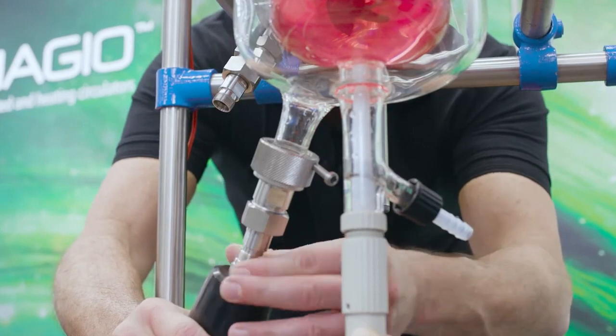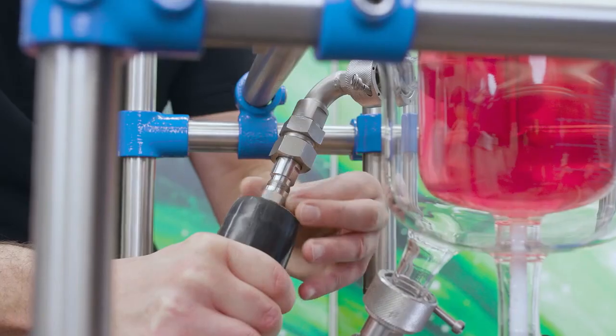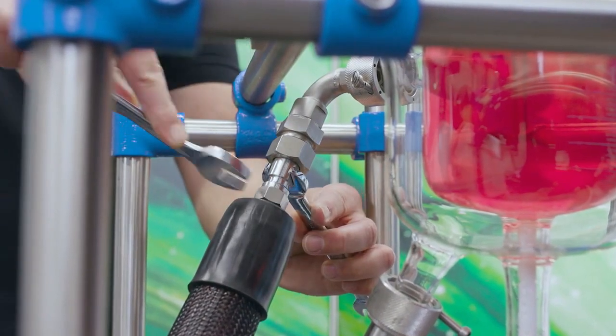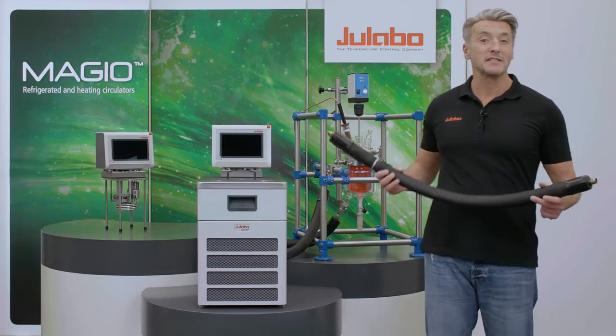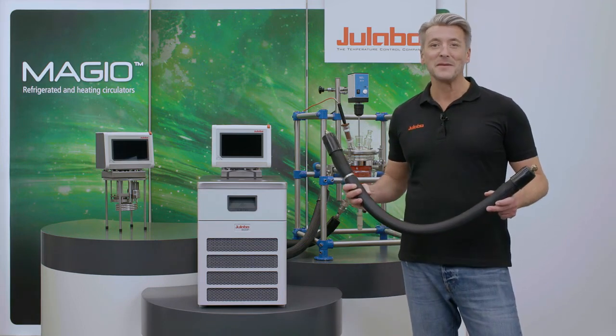The output is always connected to the lower connection at the reactor or external recipient and the input to the upper connection. In this way, possible air in the system will be able to escape correctly. To ensure you get the best performance, we offer special insulated tubing in various different lengths. Please make sure not to bend the tubing too much and always keep the specified bending radius.